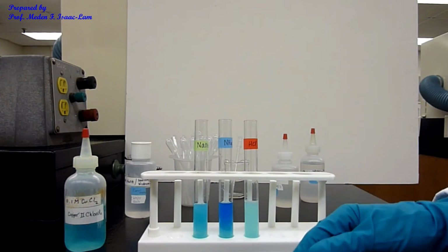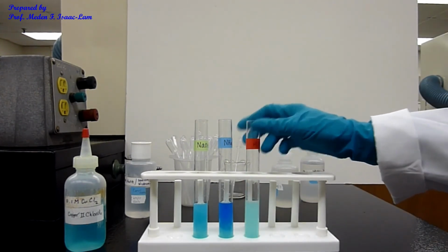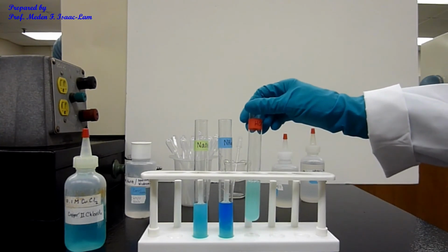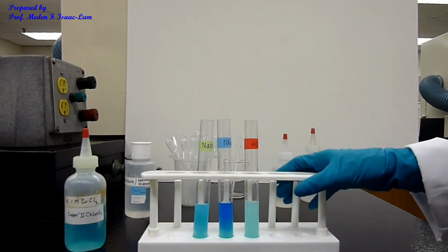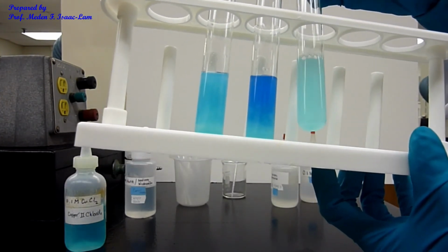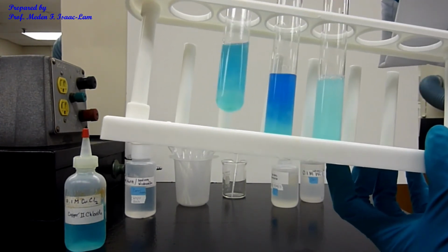Adding a base, you have more formation of the solid. However, adding an acid, you have less formation of the solid. Actually it dissolves to form more of the ions on the right side of the equation. So this one has less precipitation, this one has more at the bottom, as well as this one.